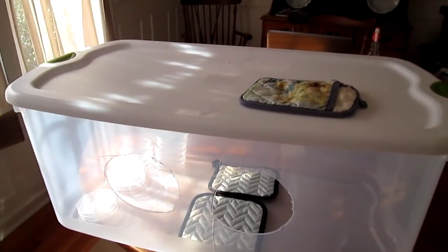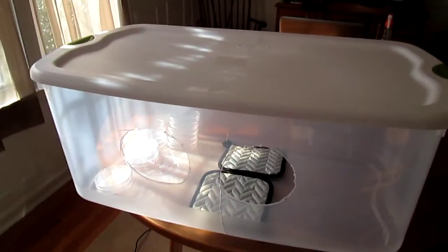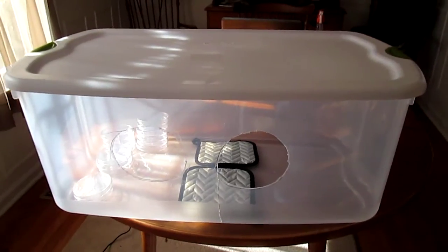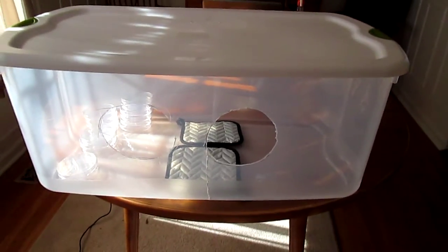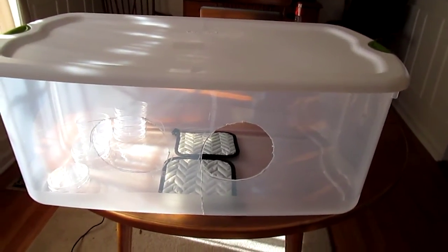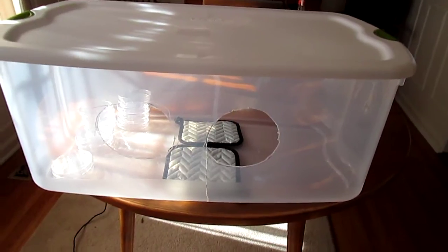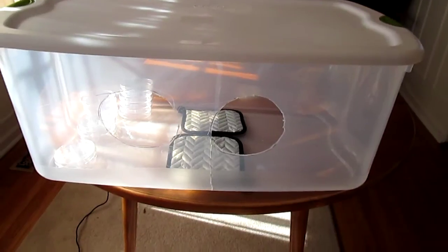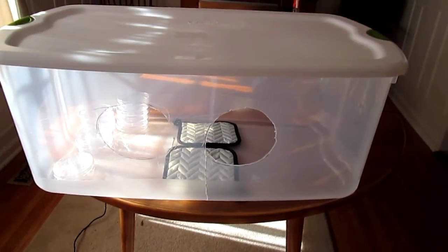I finished sterilizing the agar for 90 minutes at 15 PSI in a pressure cooker. What you're looking at is my still air box. Inside I have two silicone oven mitts, and they're in there to absorb the heat from the agar that I'll be putting in there while it's in the jars. It'll be very hot — it'll burn right through the plastic, burn your tabletop. Those silicone mats still don't fully mitigate the heat.